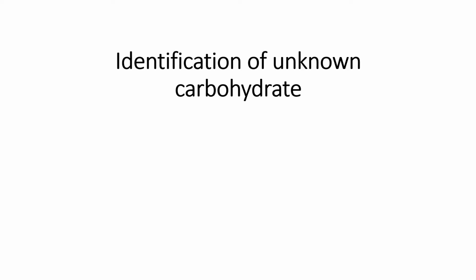Today in this video I'm going to tell you how to identify a carbohydrate from an unknown solution. What are the different tests you are going to do sequentially? Just see that and try to understand, so that you can find out what kind of carbohydrate is present in that particular solution.